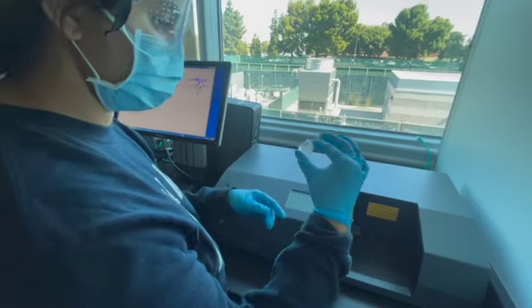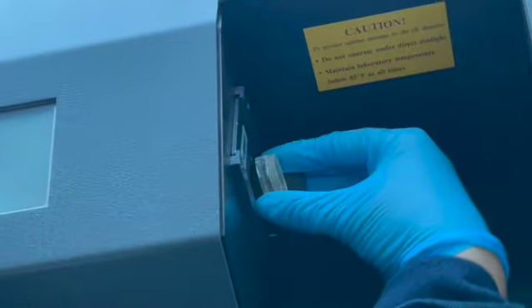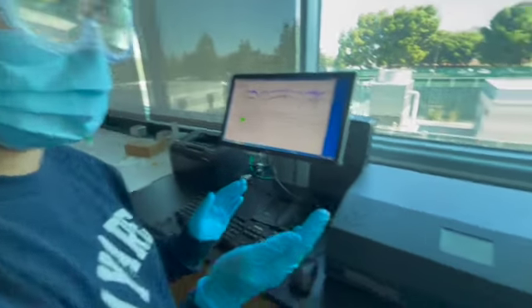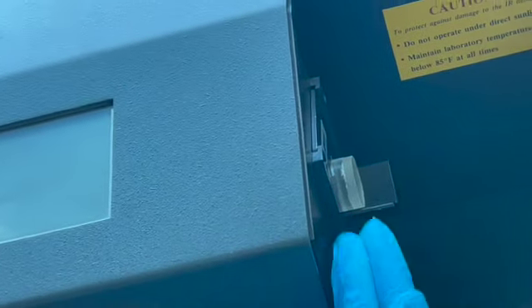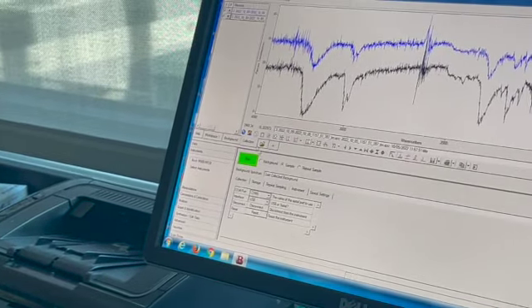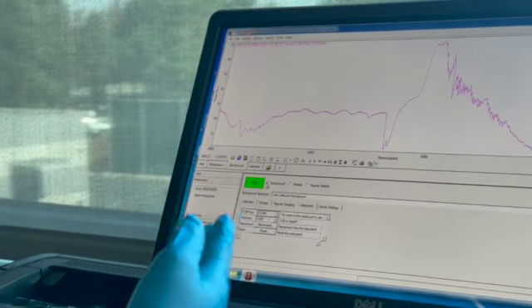First we're taking our two salt plates and putting them into the machine. We took our two salt plates and put them into the machine to blank them. Now we're going to go to the program and select the background setting. After switching the program to the background setting, we're going to click start.